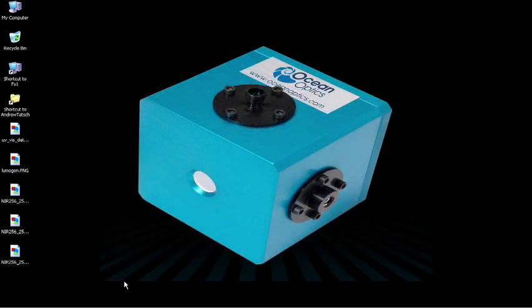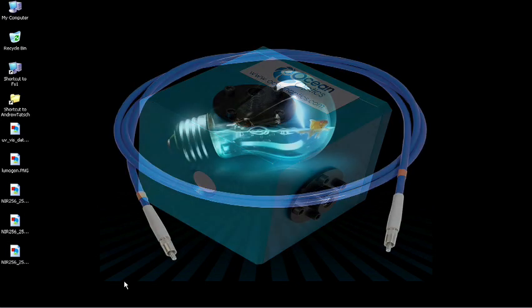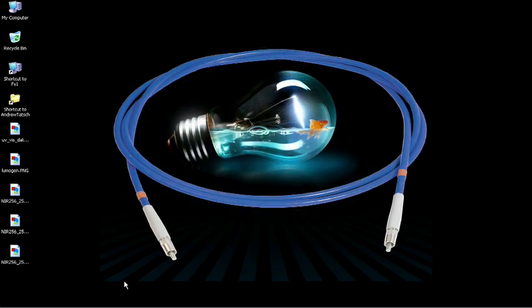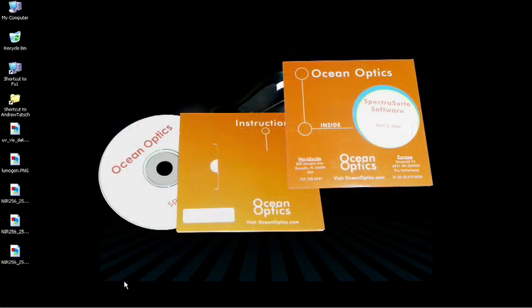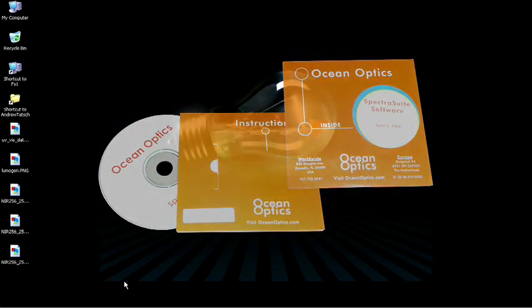an FOIS-1 integrating sphere, a 600 micron VIS and IR fiber optic patch cable, and the SpectraSuite software.